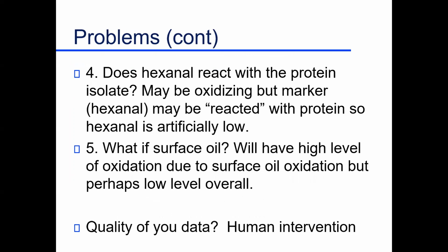One thing I think is interesting today: in 2009, I published a paper looking at the encapsulation of flavoring materials and lipids in protein solutions. My whole goal was to ask, is this oxidizing? How fast is it oxidizing in storage? So I prepared the material and spray dried the powder. I have a powder based on a protein plus fat, another protein plus, let's say, flavor molecules. I put them in storage and sample them at every period.